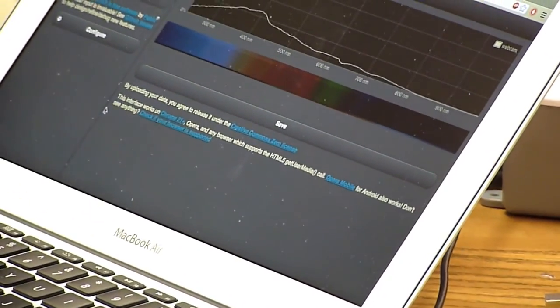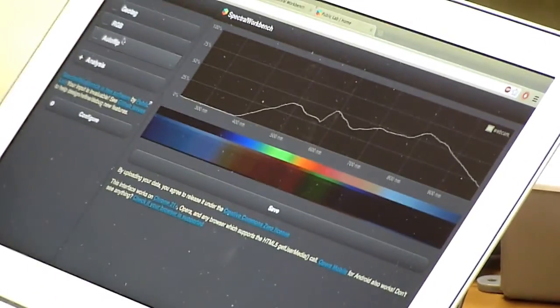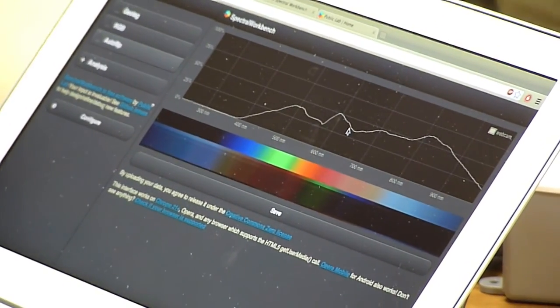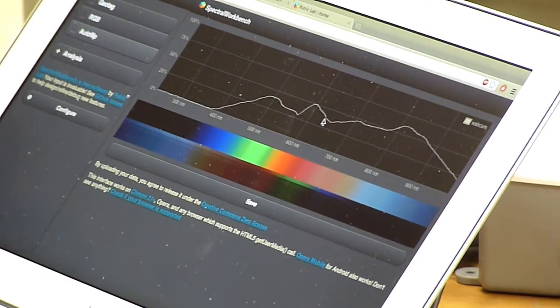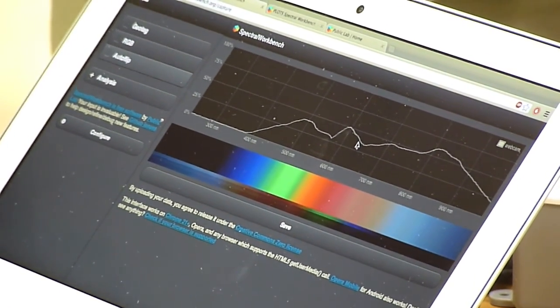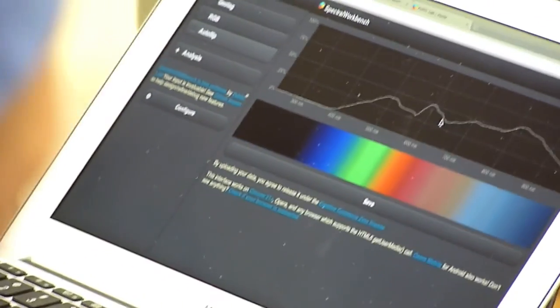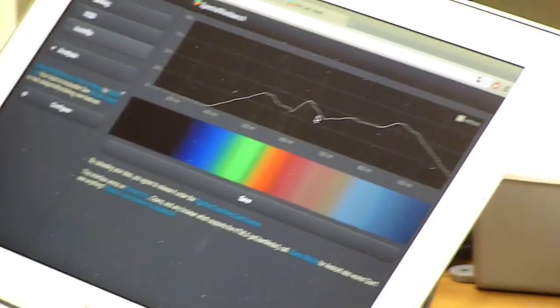Alright, so now you can see exactly the wavelength that the light is at. So now if we want to test something, we can put it in and it'll be scaled data. So that's what we call the hello world of spectroscopy, for your programmers out there.